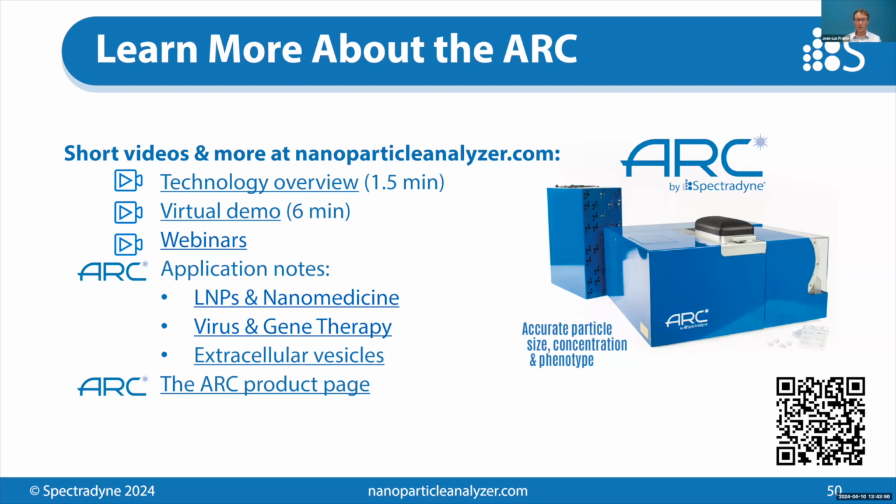Okay, next question, is the ARC able to detect number of RNA copies per LNP? That's the part we're working on, the conversion of brightness of a single particle to mass of RNA, essentially. That's what you want to know per particle. We're not quite there yet, but stay tuned.